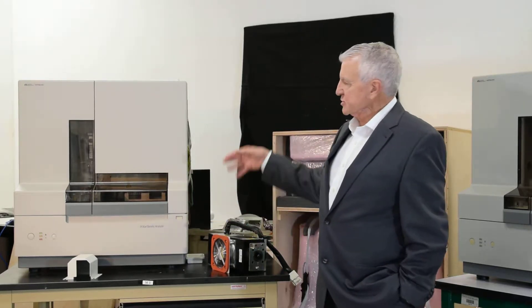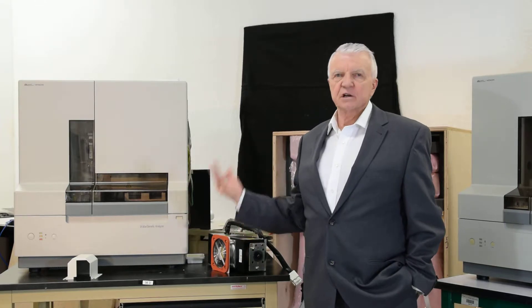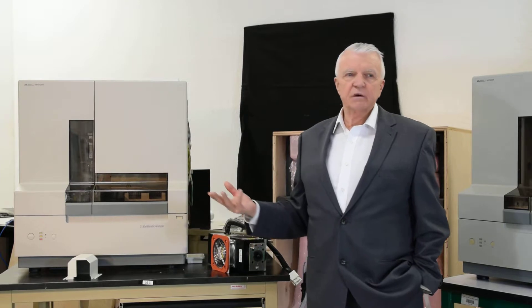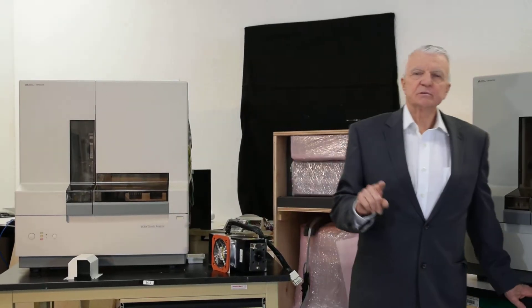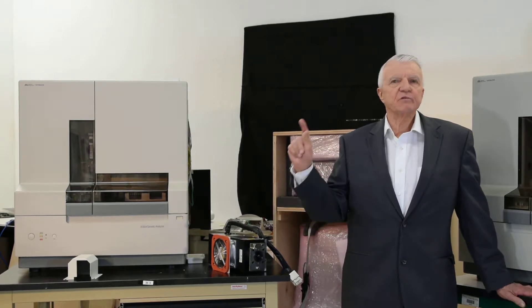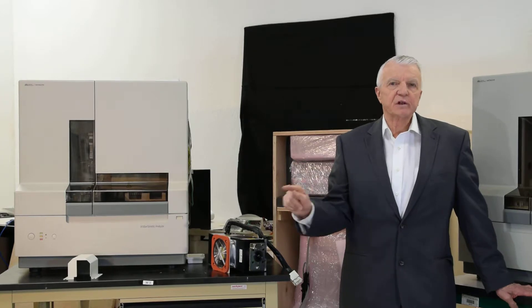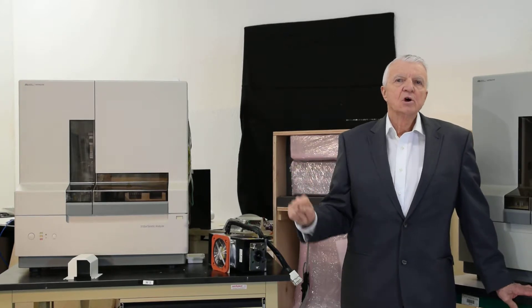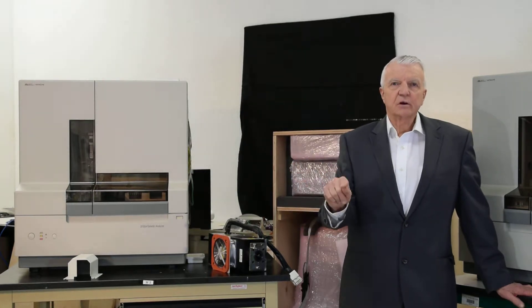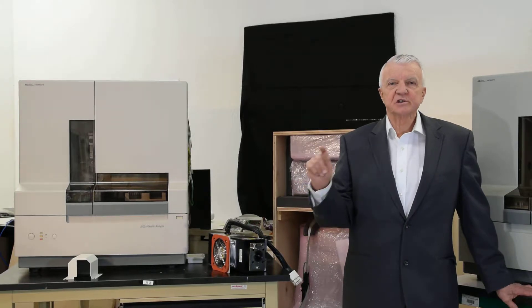We can work on these and service these from one end to the other, and our service person — because she's done hundreds of these — we know what we're doing and we can give you service 24/7. When you're buying an instrument, you don't want it coming from a company that's using a third-party provider for installation that may or may not be available when you need them. You can talk to our service engineers on their cell phone at our lab. We're a brick-and-mortar place — you can come visit us and see what you're getting.